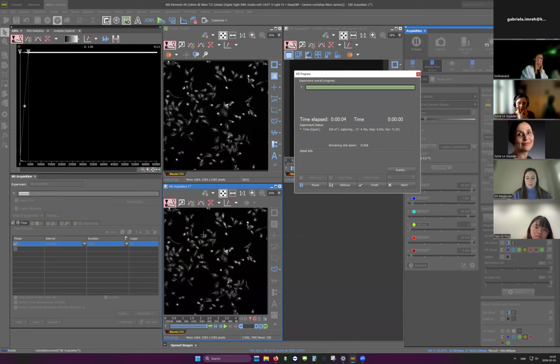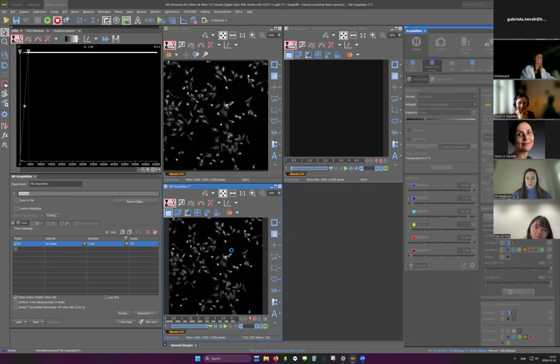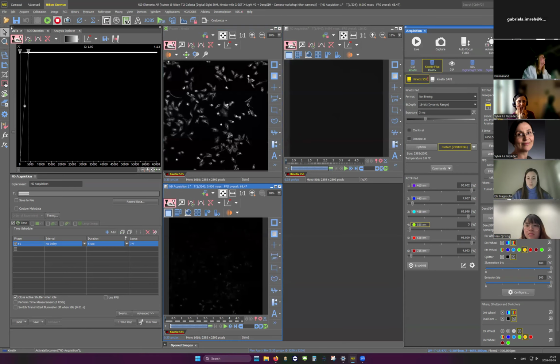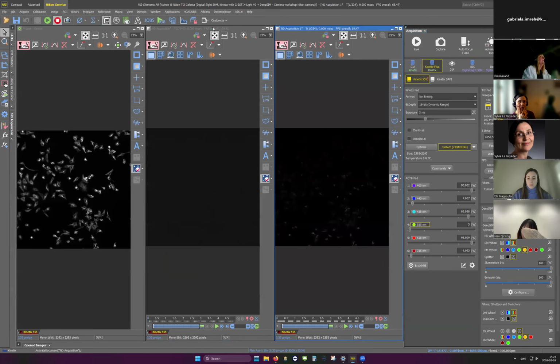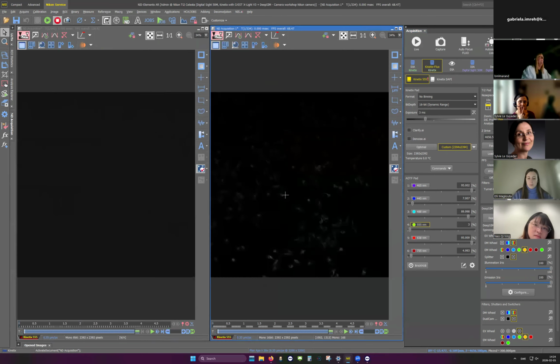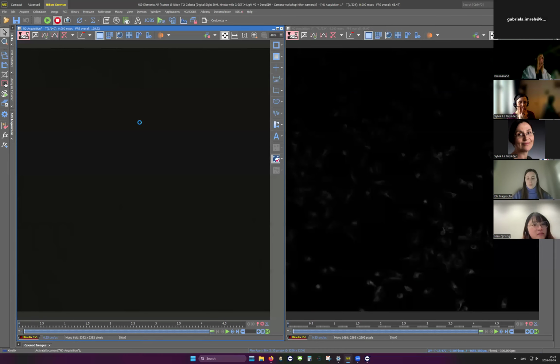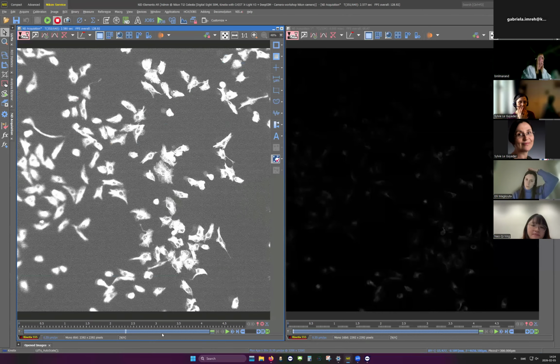I think you already here in the time lapse can see that it's a little bit slower. And get rid of that one and that one and push the lookup table a little bit. There we go. Synchronize.